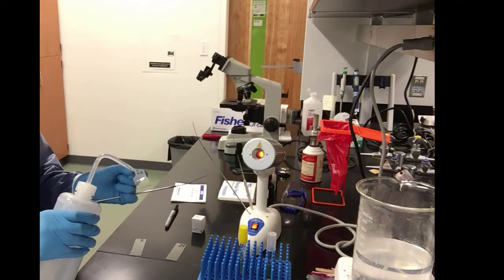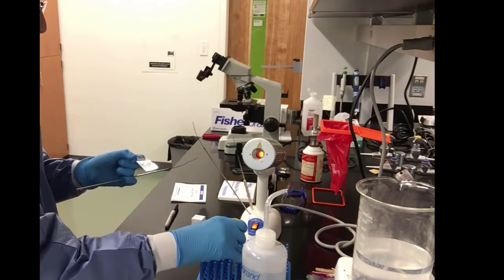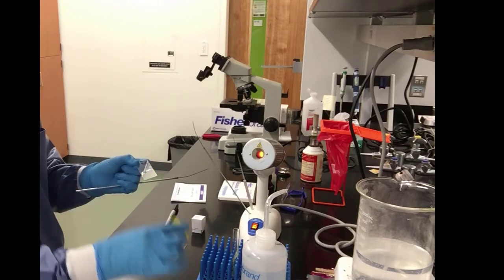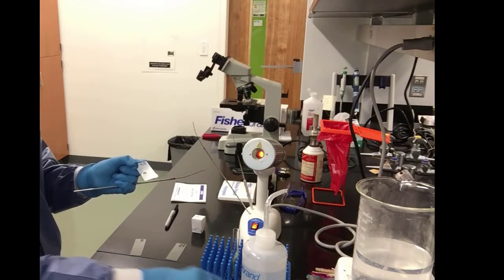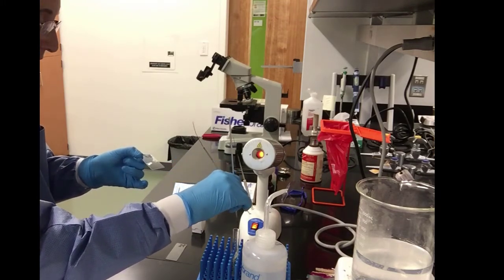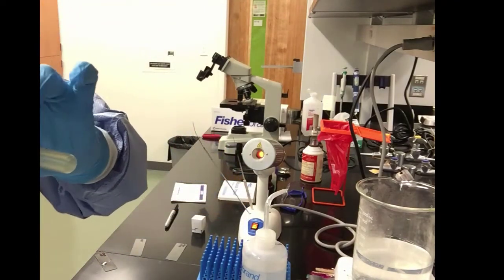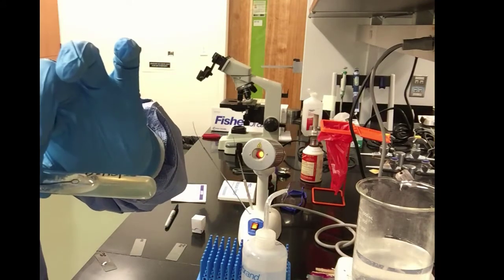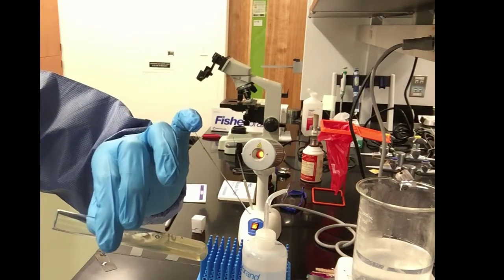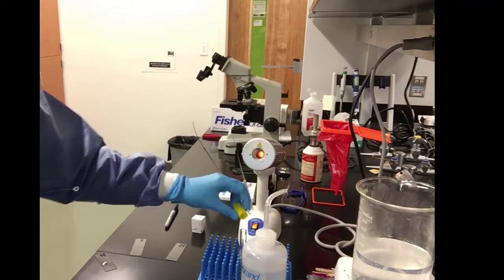We put a small little drop of water. Oops, a little too much there, but it's okay. It'll take longer to air dry. We will take the cap off, and usually we have to hold on to the cap, but for now I will put it on the table so I can demonstrate with the slide in my hand. We will pick up some of the staph from the slant gently. We don't want to pick up the gel. Let me show you here. Go really into the slimy bacterial community there. Pick up some from the surface, avoiding picking up agar. We don't want to pick up agar because that's going to be a big clump in our slide.